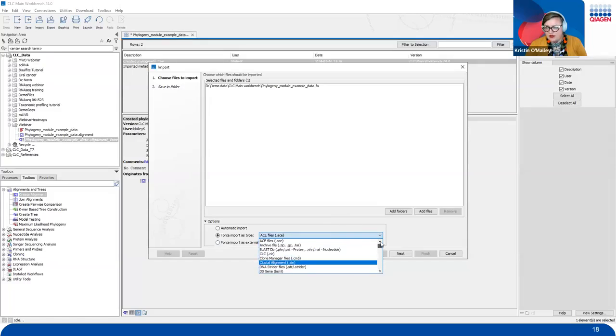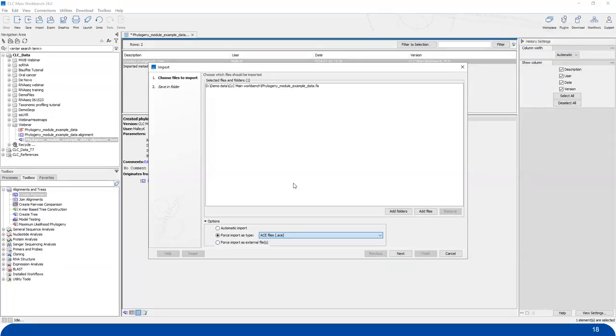I don't know, Araceli, do you know if we are able to do that? That's a good question. Or Sean? Sean's on the line. He is the guru in all things CLC. So we can get back to you with that answer in the chat box. Oh, Deb, to the rescue. Yes, the answer is yes.